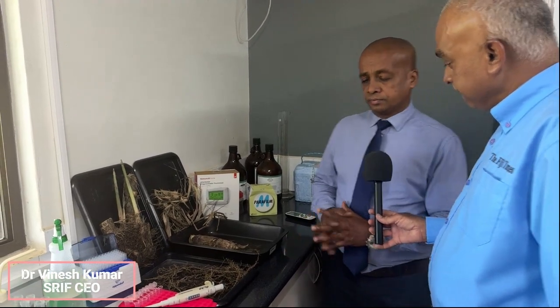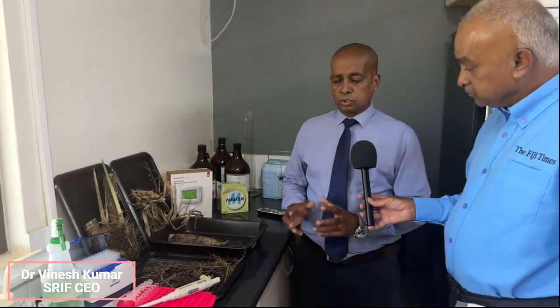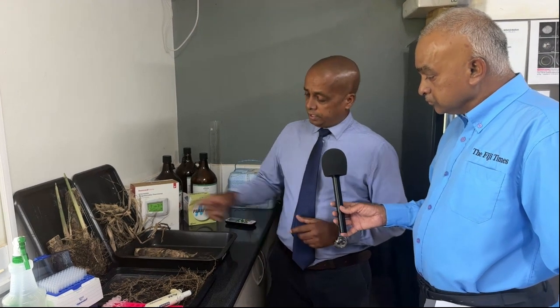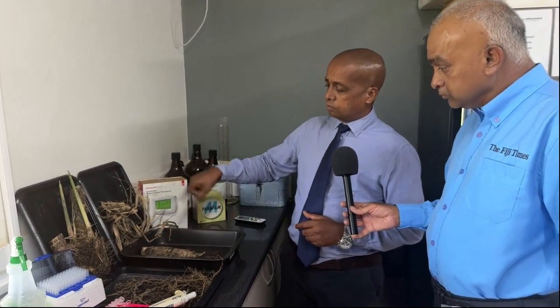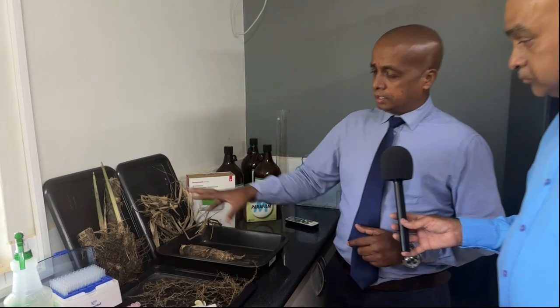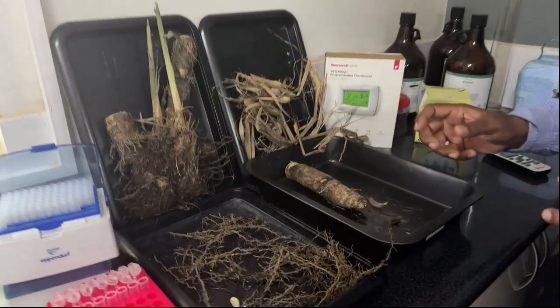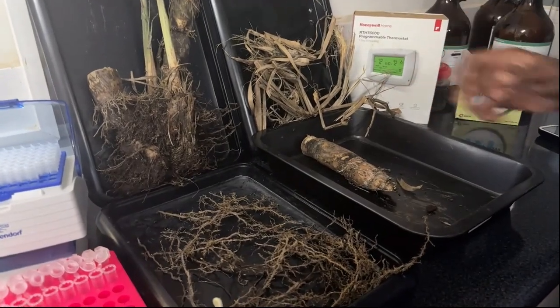This unit is very important for the sugar industry because we look after the pests and diseases in the sugarcane plant. One of the factors that affects production is pests and diseases. Here, if you can see, this is a sample taken from a field in Reki. There's some unique feature that a farmer observed, so we took out samples and brought them over here for detailed analysis.